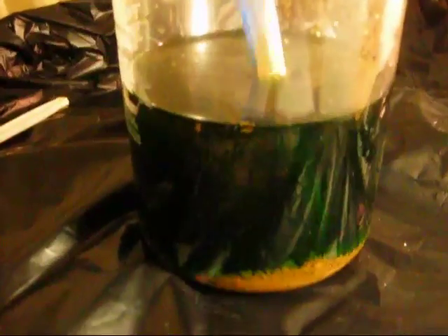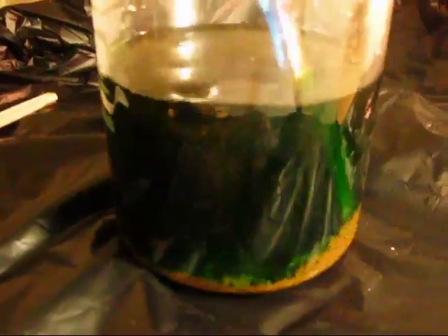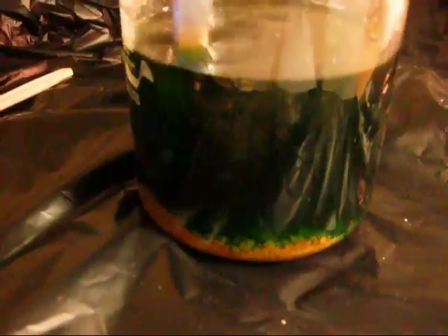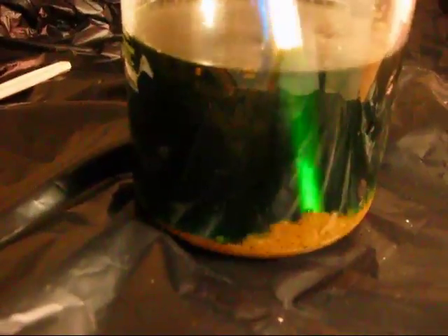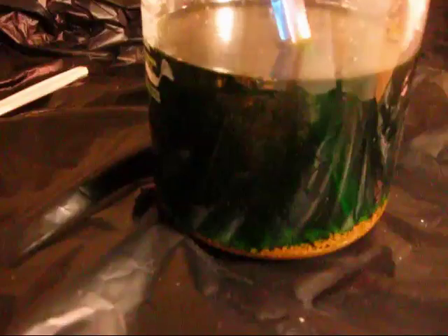Once I get this all rinsed and dried out, then I can melt it. Now yesterday I got a little impatient and I scooped some of this out and rinsed it using purified water and tap water. I'll show you what I have left after I melted it.